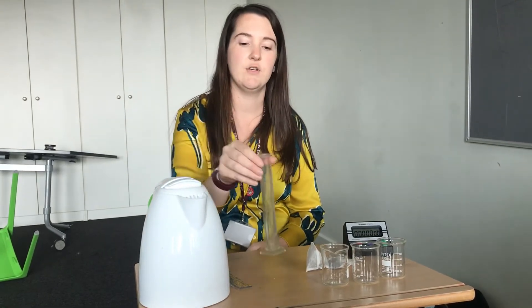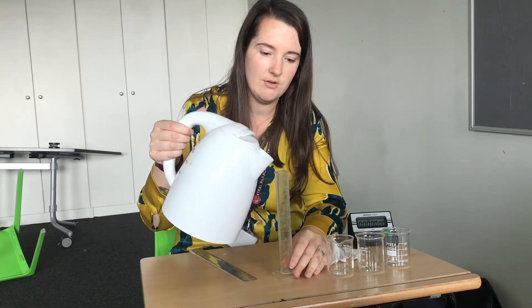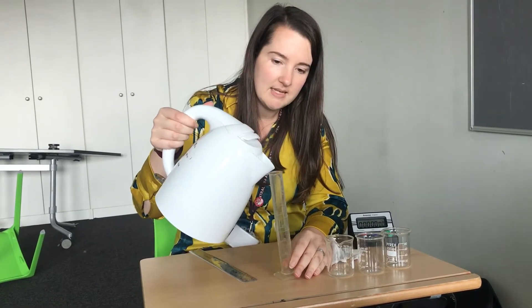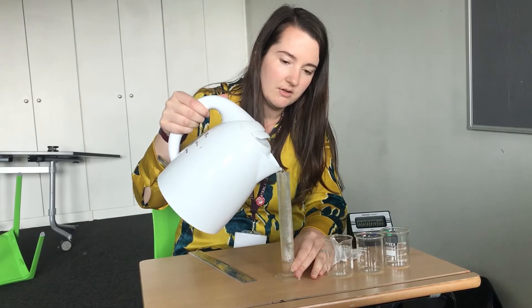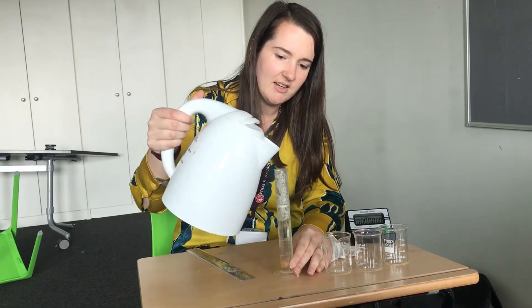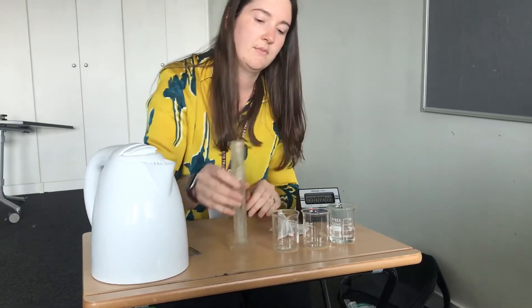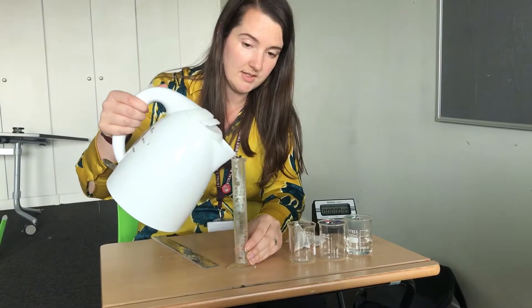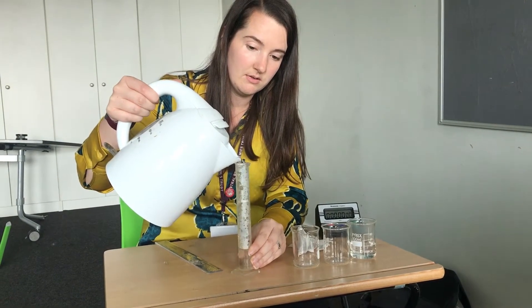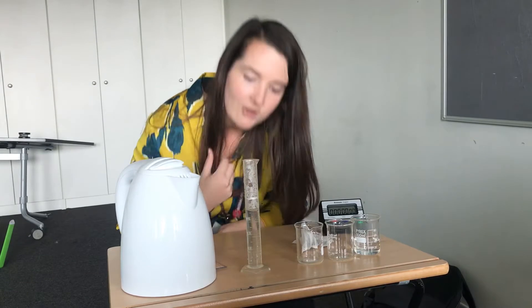Now that I've measured them we can do the experiment. To make sure that it's a fair test I'm going to make sure that I use the same temperature water and the same volume of water. We're going to use 40 centimetres cubed of water in each one. Remember to put the measuring cylinder on a flat surface and then look at eye level.